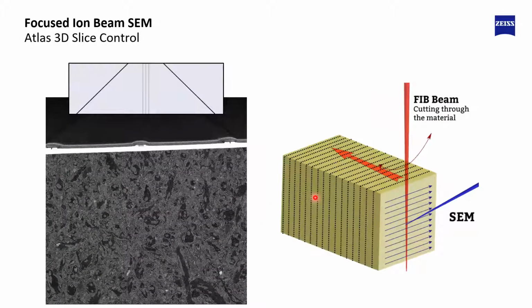So I mentioned that the focused ion beam is pretty much our replacement for the diamond knife. It's a very, very precise ablation tool or mechanism that we can use for this kind of acquisition. So if that is our sample, again, we are creating a new block face. The focused ion beam trenching goes in the red arrow's direction, and the scanning electron microscope scans off this block face.